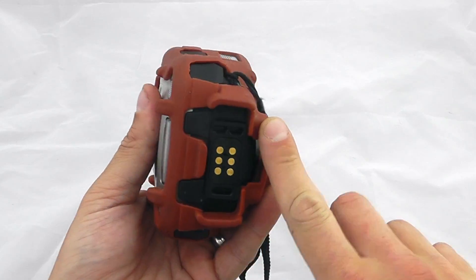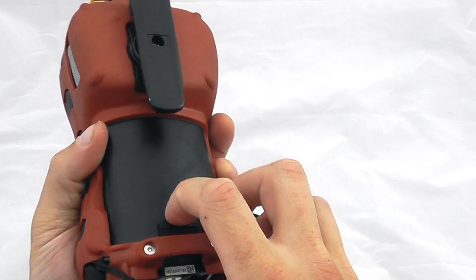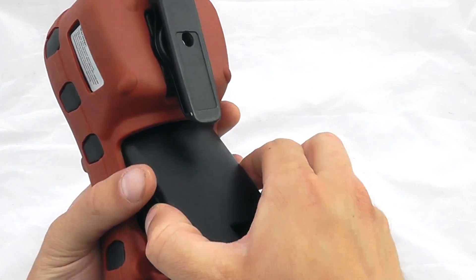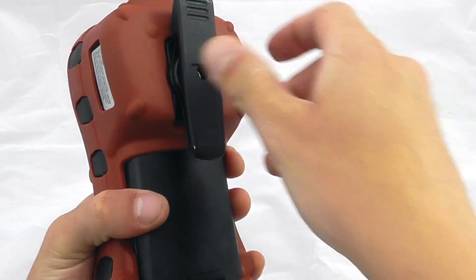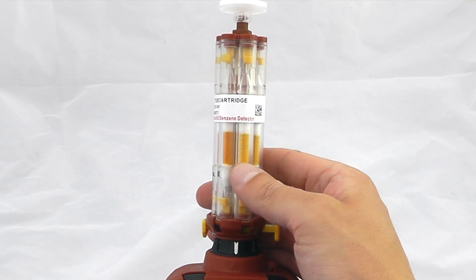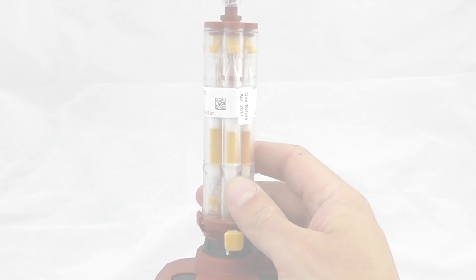Charging is via the bottom ports. There is a removable rechargeable battery or alkaline battery pack available. We've obviously got the twist adapter to attach the belt clip, and then the benzene tube-specific tube assembly on the top of the instrument.